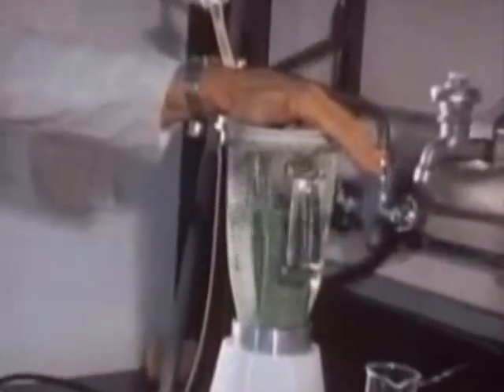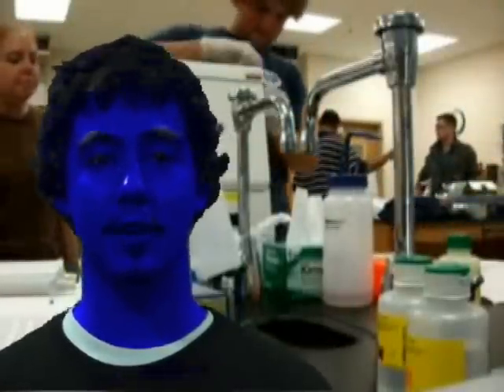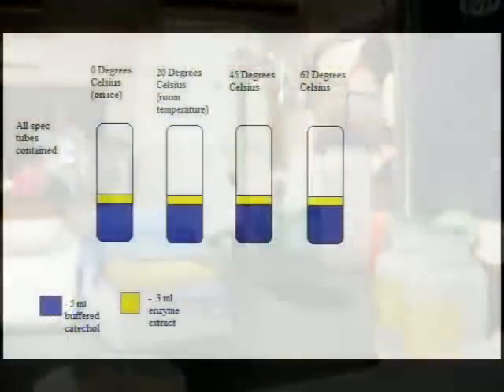The enzyme we used was called polyphenol oxidase and is found in potatoes. To do our experiment, we were going to have to use potato extract. To get this extract, we took potatoes, put them in a blender, and ran the blender. This broke the cell membranes, releasing the cytoplasm where the enzymes are contained, allowing us to experiment with it. Polyphenol oxidase catalyzes catechol to form orthoquinone. This product produces a reddish-brown color, which we can detect in a spectrophotometer. Using this, we can measure the absorbance and therefore find the rate of the enzyme.